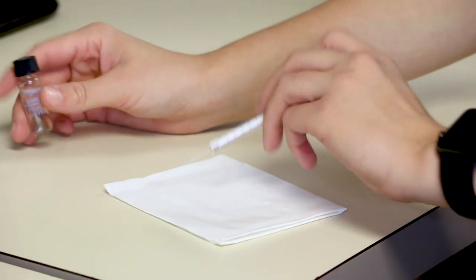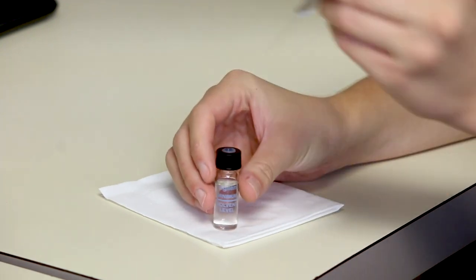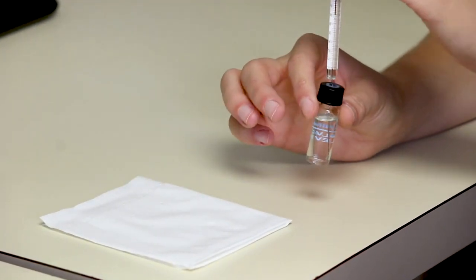First things first, we clean the syringe. You gotta make sure to clean it thoroughly. To make sure we're extra clean, we do it three times.